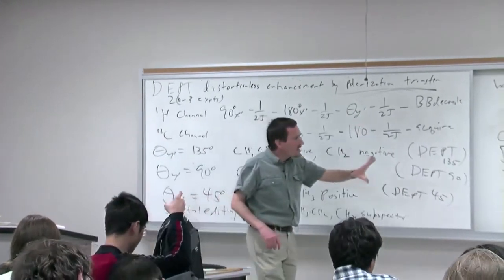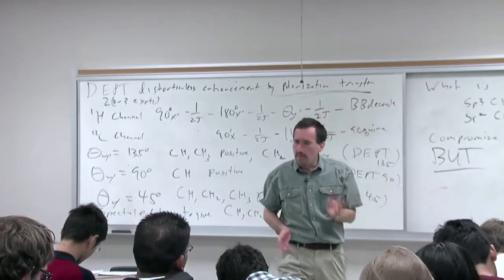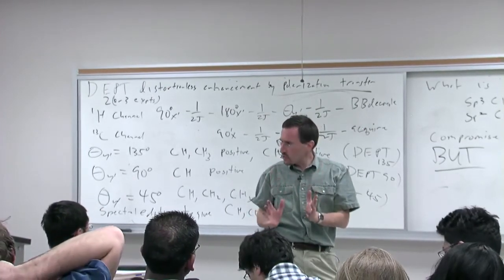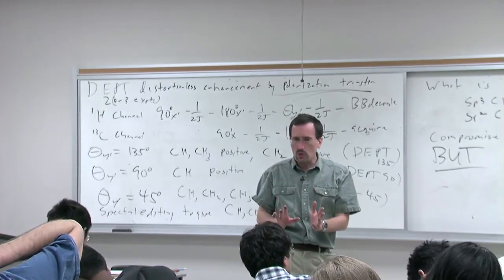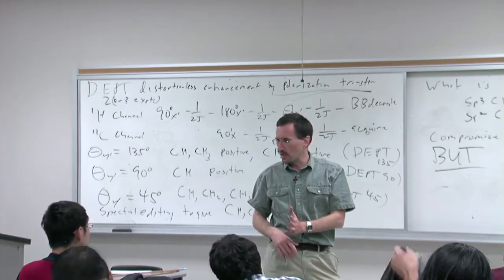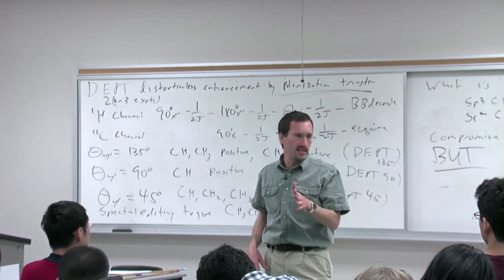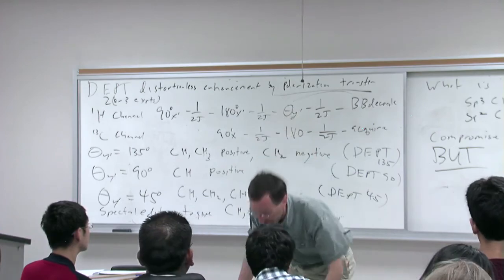So the main take-home message is in all of these pulse sequences, you're making choices about delays that are based on coupling constants. And if those choices, they're always compromises, they're always estimates, if those choices don't match your molecule, you will get confusing results, which means always be careful in interpreting your spectra. And when you're collecting your spectra, pay attention to those parameters that Phil talks about because they actually have meaning.